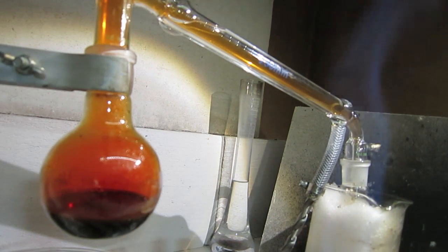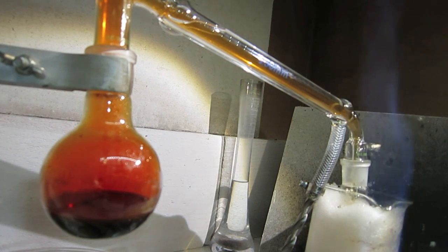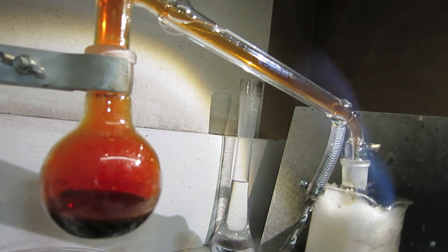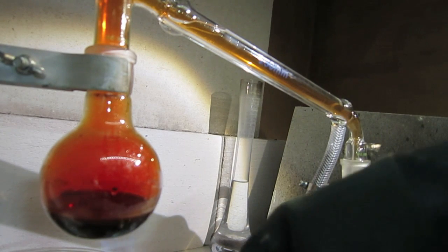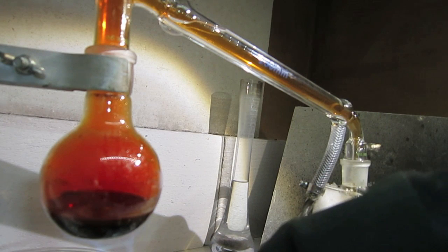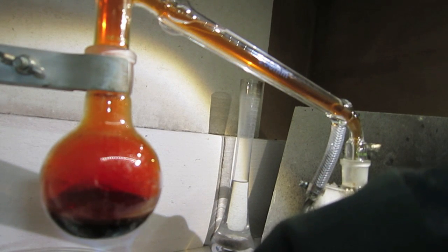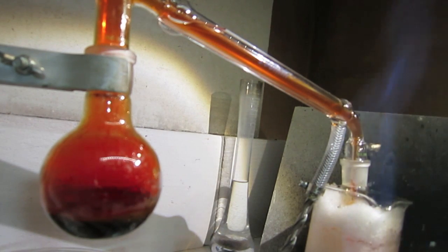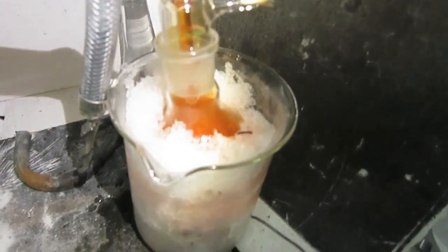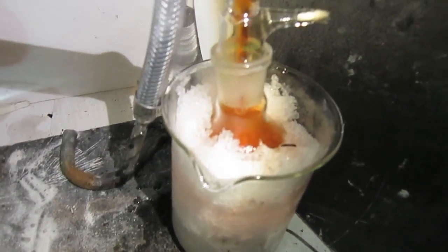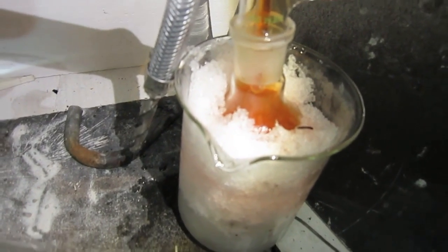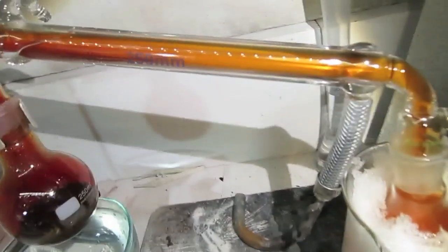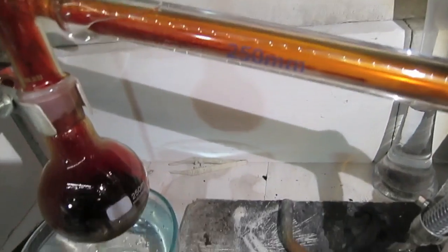So now the vapor is appearing. At the other end, bromine is appearing in the ice-cold receiver. I hope it's condensing enough. Yes, I see in the tube here there is some bromine liquid.